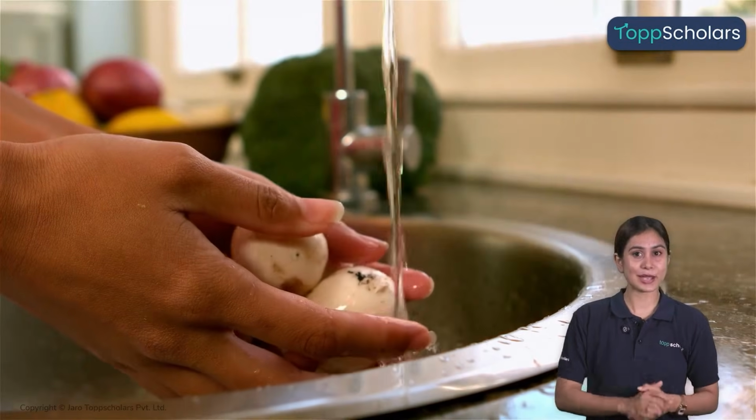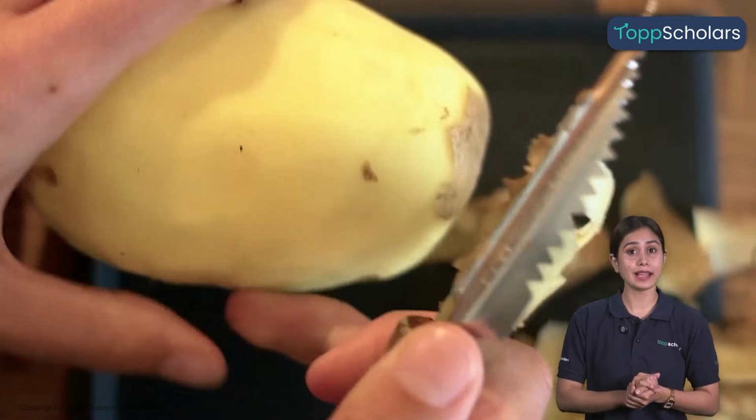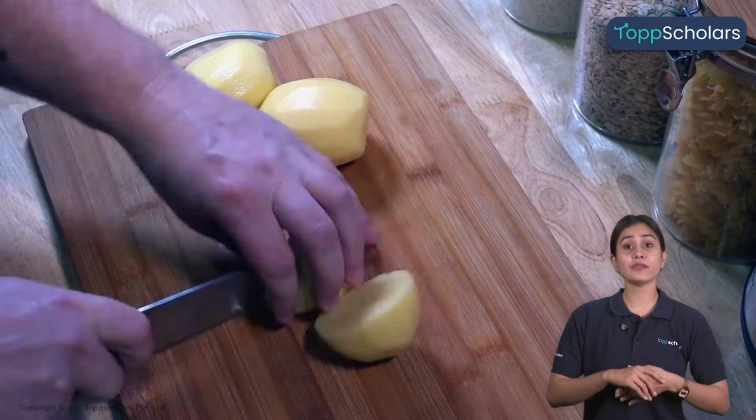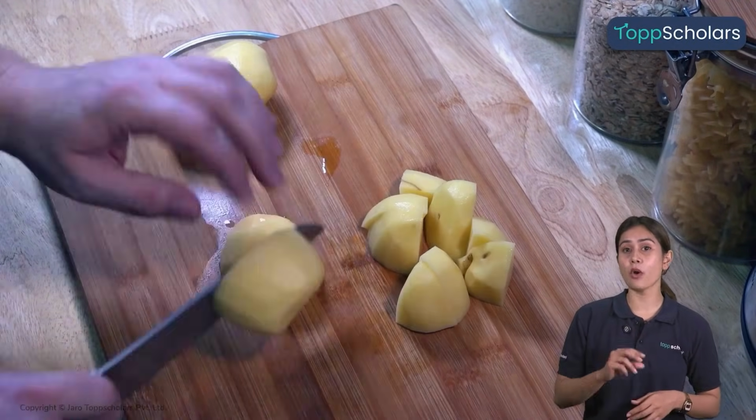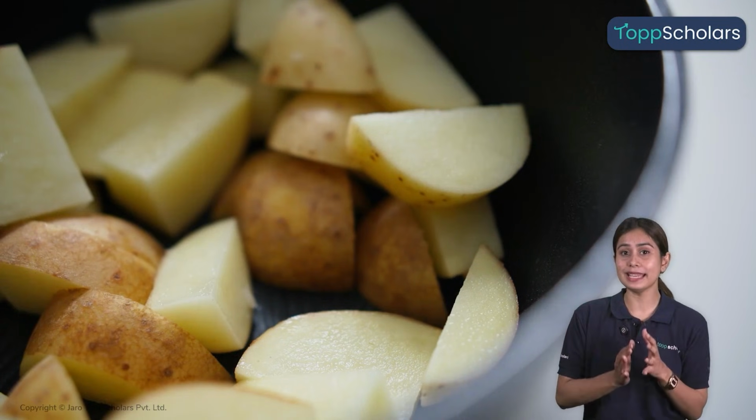First things first, we will take a fresh potato that is washed, cleaned and dried. Next, we will cut the potato into small cubes or slices and place them on the clean and dried dishes. Now it's time for some chemistry.